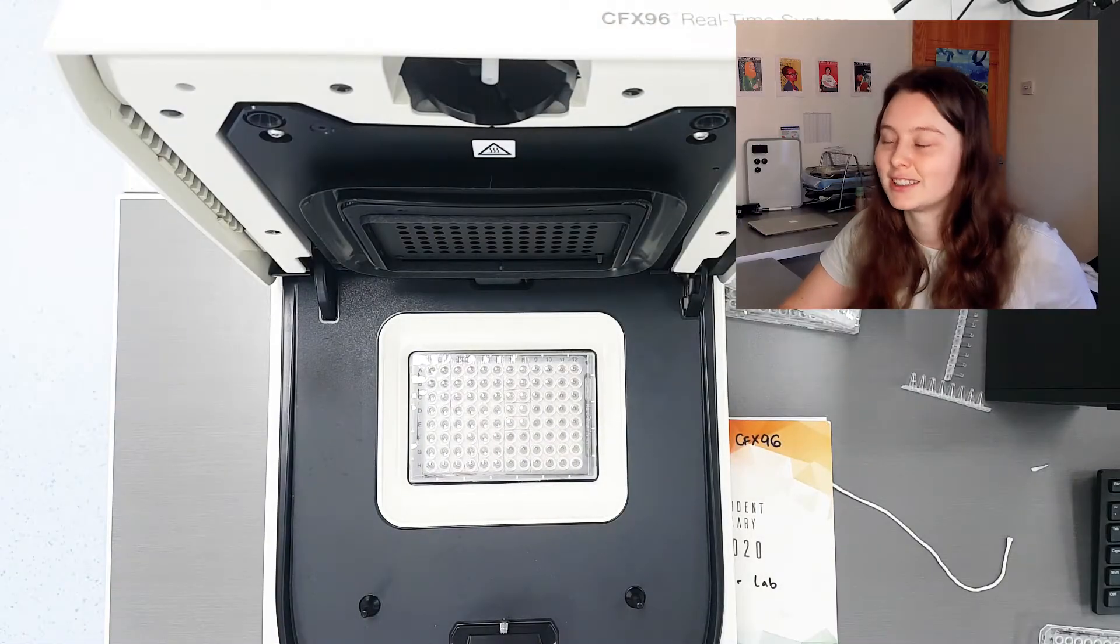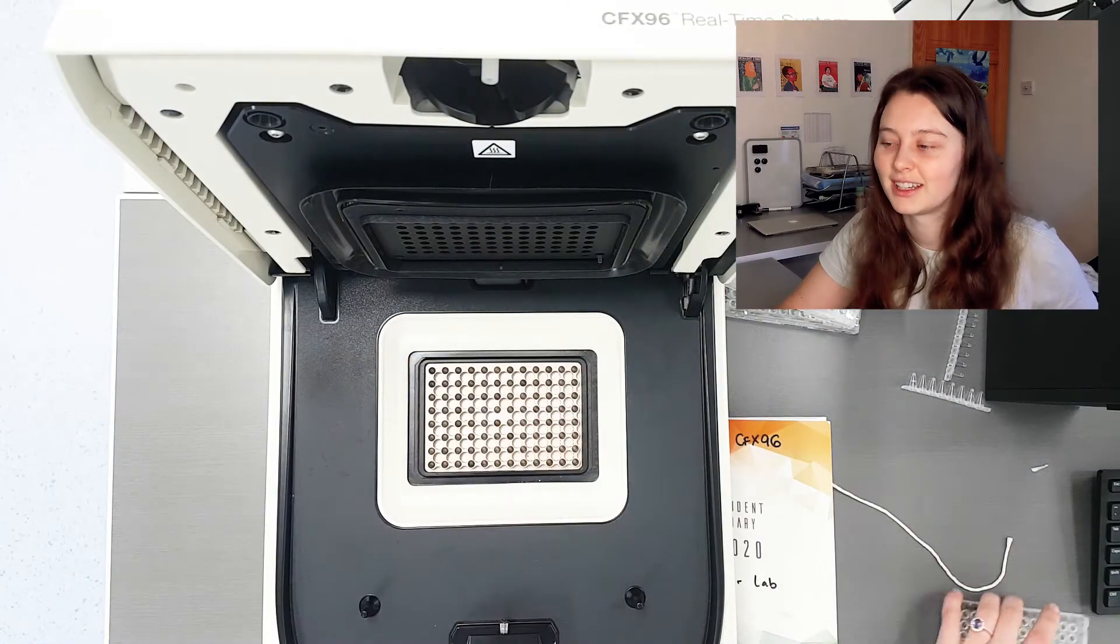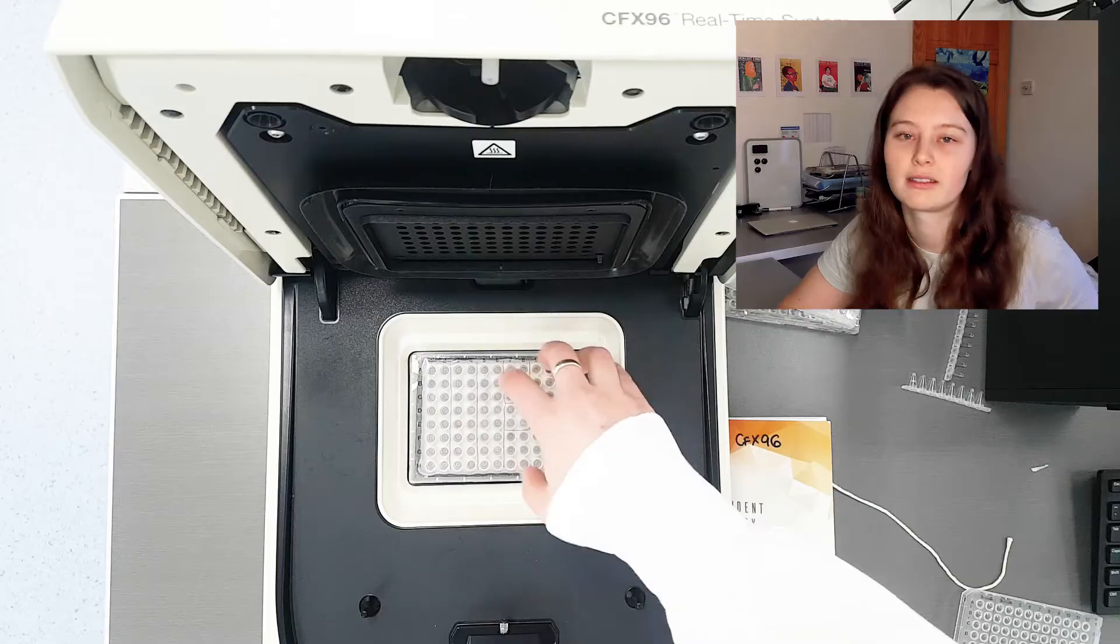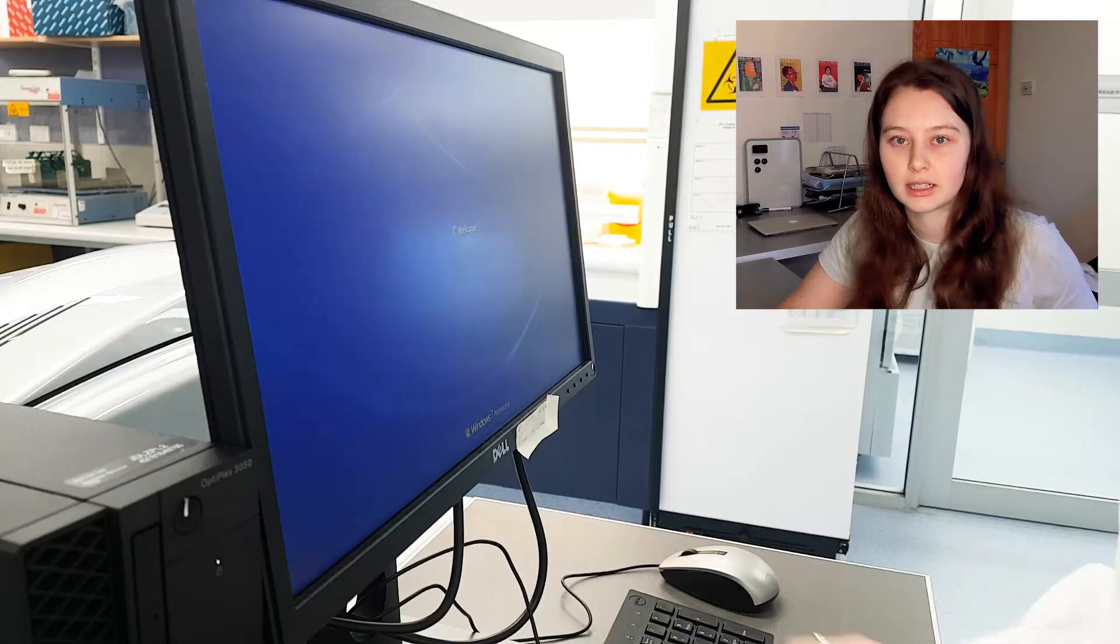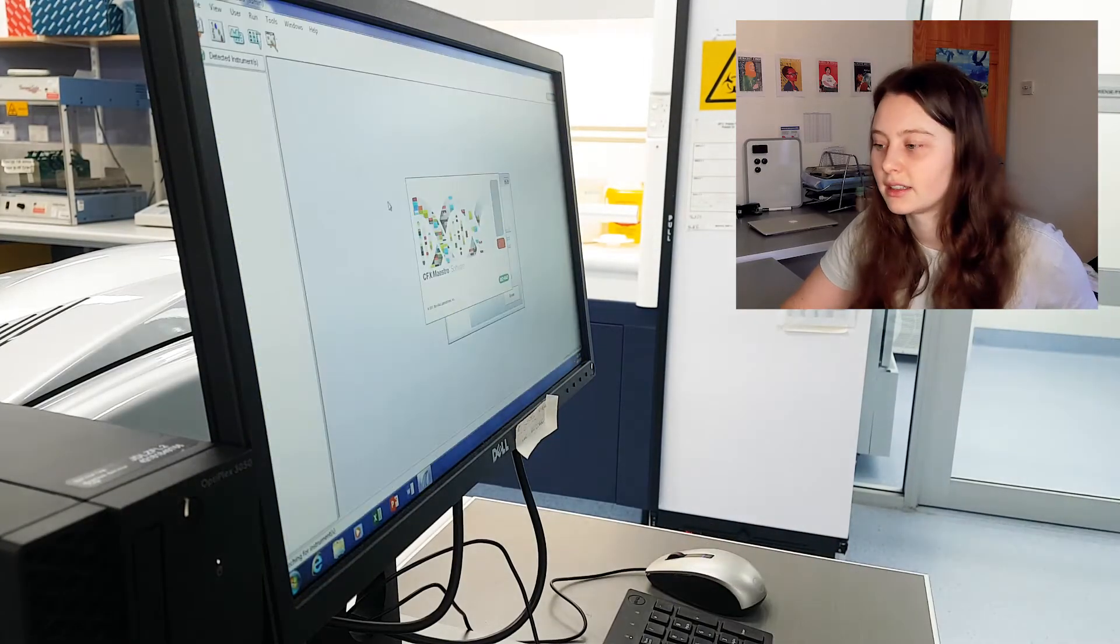So pop it in the BioRad machine, take out the plate that someone else left in there. It was definitely me earlier that morning. At this point I was doing about three qPCRs a day, so I was just cycling through them.